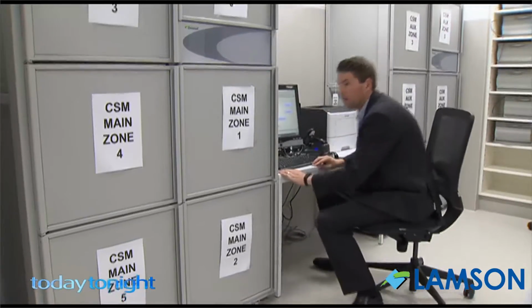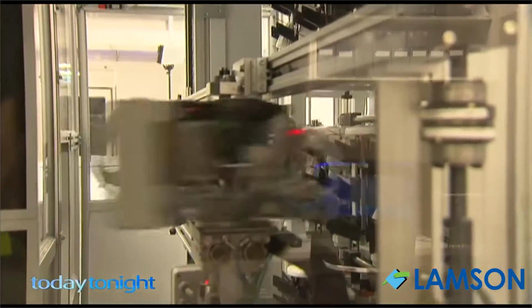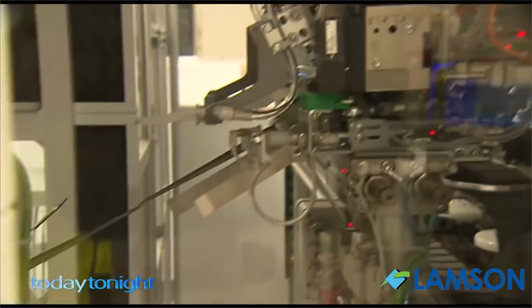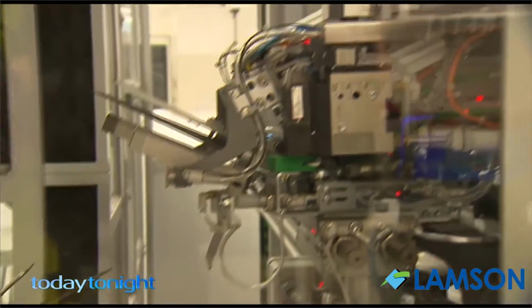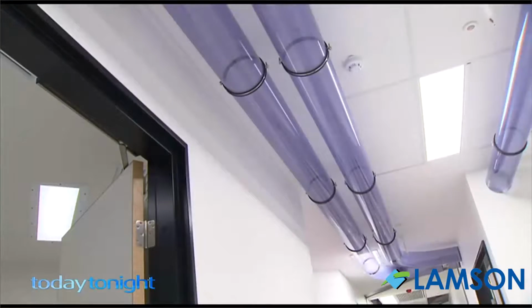It's very, very futuristic. This is the most automated pharmacy in Australia at the moment. Christopher Hops is the Chief Pharmacist at Princess Margaret Hospital. He says the new pharmacy at Perth Children's Hospital is as high-tech as they come. The chutes that come from our whole pack robot go through to our dispensary, and they supply medications almost through the ceiling to the spirals in the outpatient pharmacy, and our robot will then go and pick the medication, put it in a box for delivery to the ward.